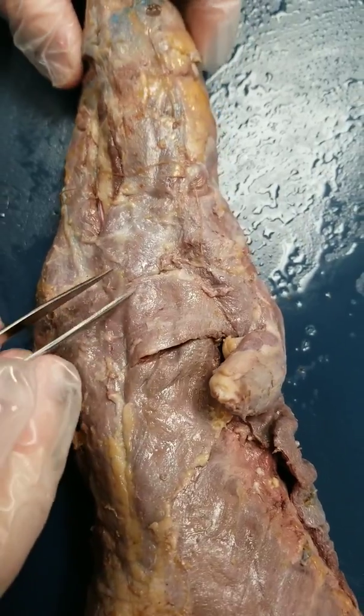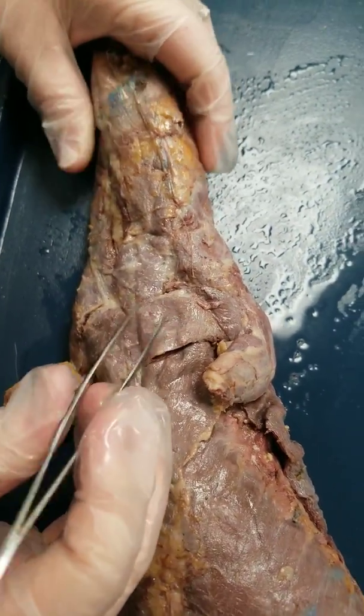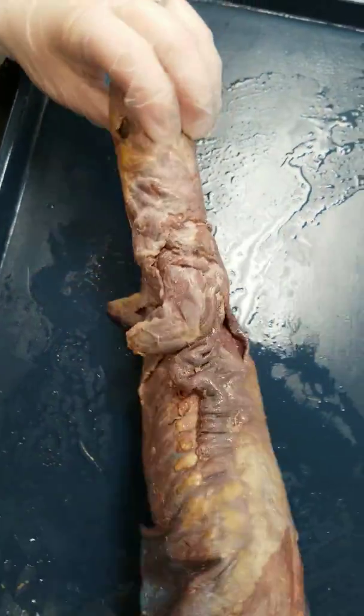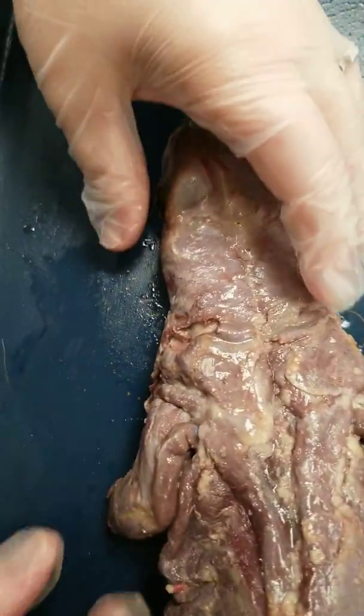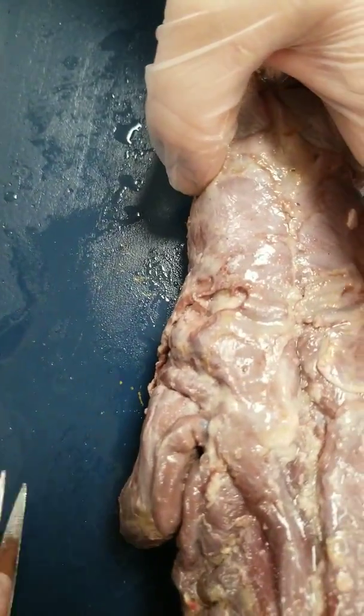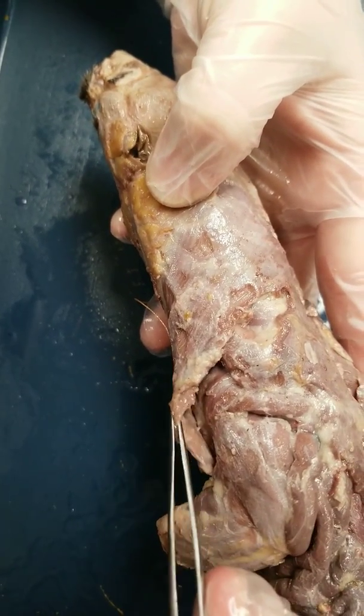Then we move up to the neck and shoulder area of the mink. I'm going to rotate her over so that you can see the muscle a little bit better.